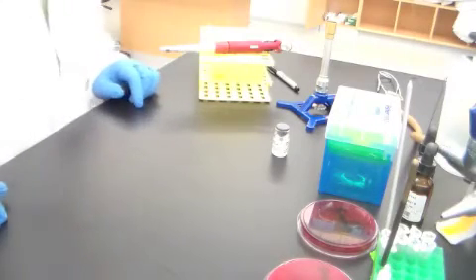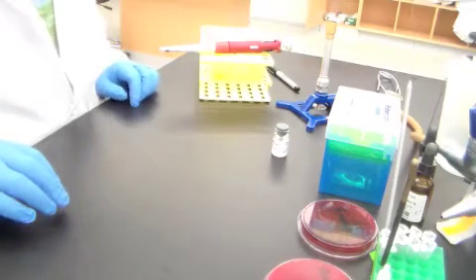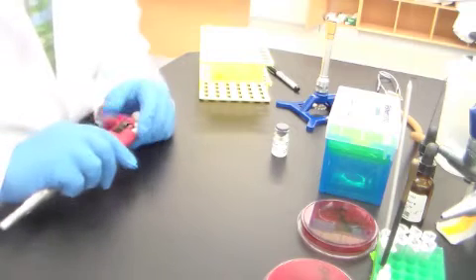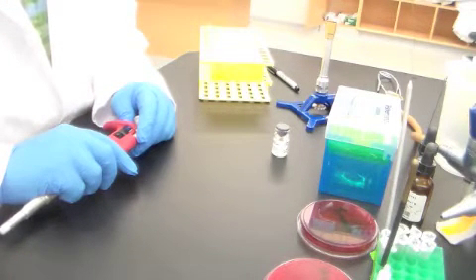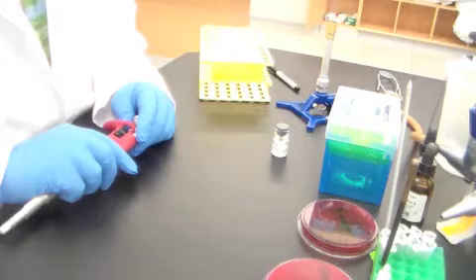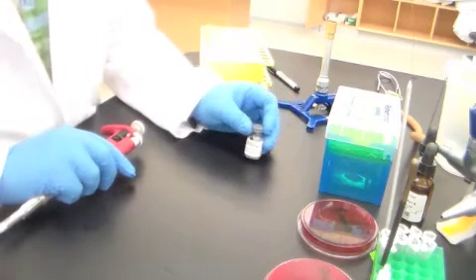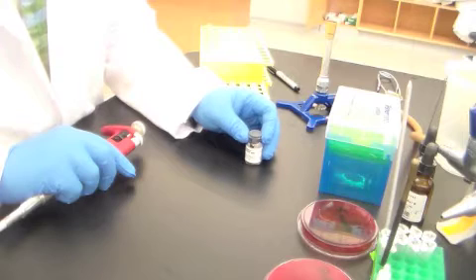Okay, so in week 6, one of the tests that you'll do this day in lab that you'll actually see the results from is a test called the coagulase test. This is not a test where you inoculate a medium and then wait for the bacteria to grow. This is a test that uses bacteria that have already grown.